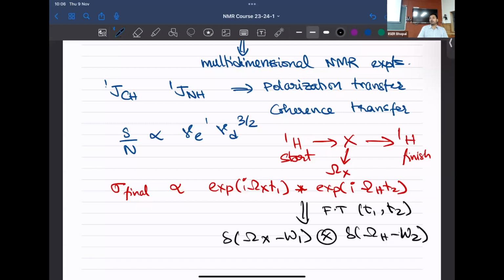This way, a heteronuclear NMR experiment could be established so that you have a correlation between a necessary spin system, meaning the CH or NH spin system, that can be studied within a given molecule, right? So these are general concepts.